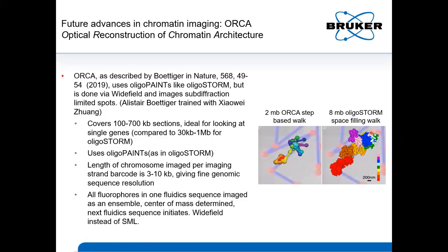The center of mass is determined from the image, and an ORCA walk is generated by connecting the centers of mass. The technique utilizes small probe step sizes and is ideal for looking at smaller regions or single genes.